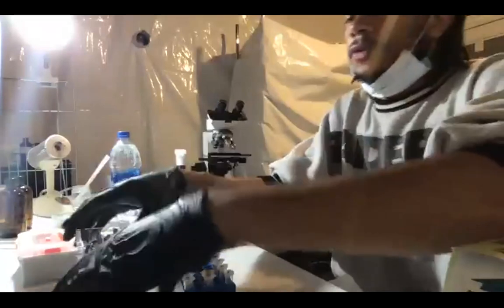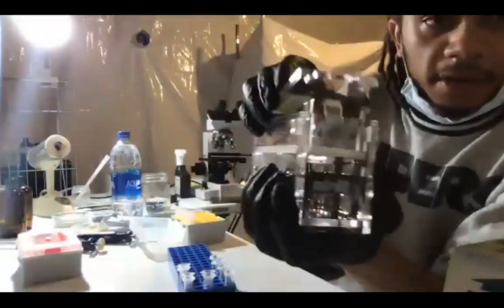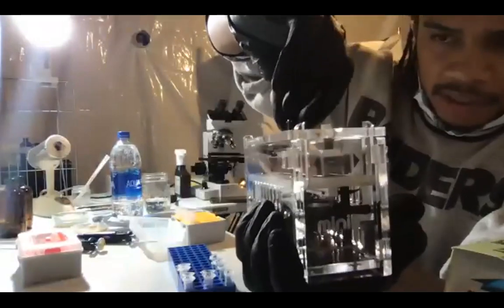All right, so now all of those are ready to go. Now I want to get this PCR running. So I just close my PCR. I gently tighten the top.